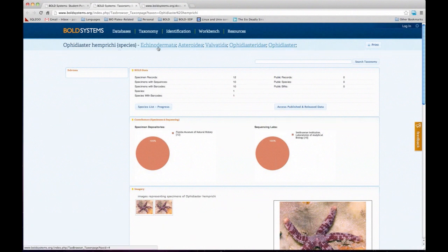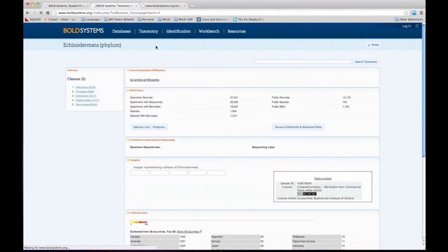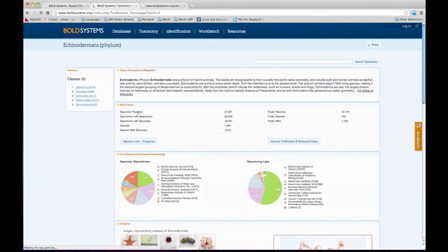The taxonomy browser gives you the full hierarchy of taxonomy for that species. I can click on, let's say, echinoderms, and it will give me a list of all those echinoderms on Bold — all the hierarchy is linked.